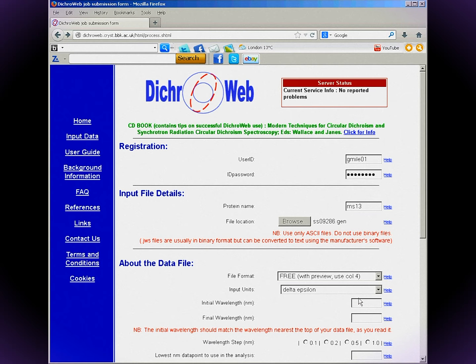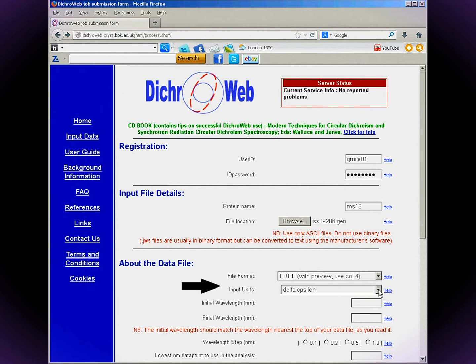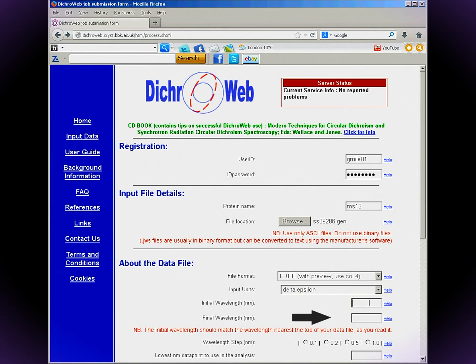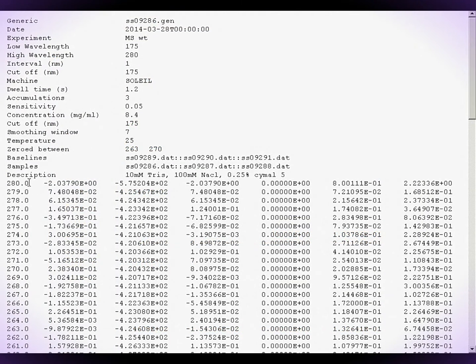Enter the input units on the y-axis of your spectrum — that's either delta epsilon, mean residue ellipticity, or milli-degrees. If the spectrum is in milli-degrees, DichraWeb will later ask you to enter the concentration, mean residue weight, and optical cell path length.